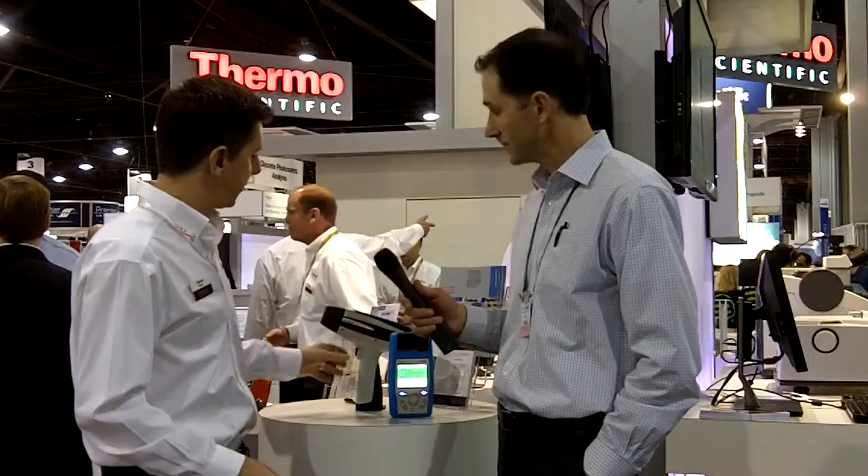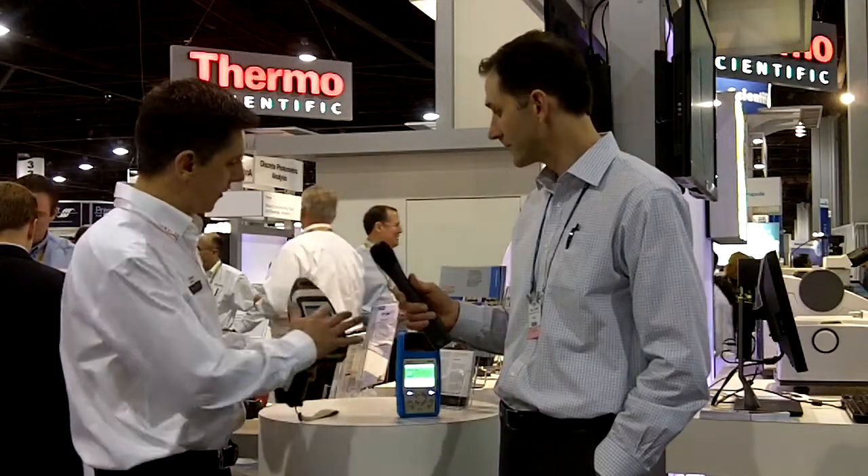You talked about the expanded capabilities, but there are still people who say Raman can't do everything — what about NIR? And now you've got a solution for that as well. It was actually a year ago that Ahura Scientific was acquired, and about six months after that, Thermo Fisher acquired Polychromix, which was an innovator and leader in handheld near-infrared — ironically about 500 meters from our factory at Ahura. At Ahura we were doing handheld Raman and FTIR, and with Polychromix they were doing near-infrared. So now we have the Thermo Scientific handheld MicroPHAZIR.